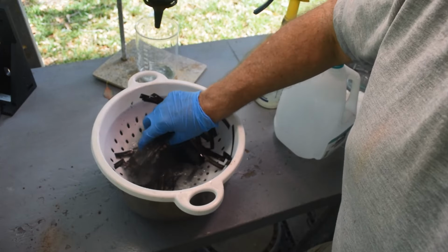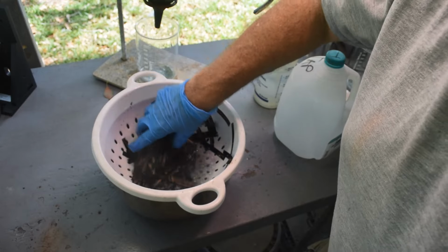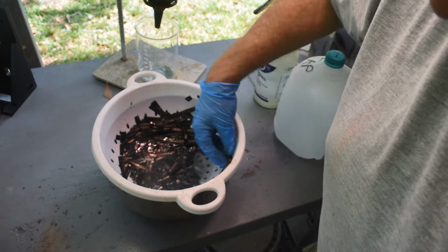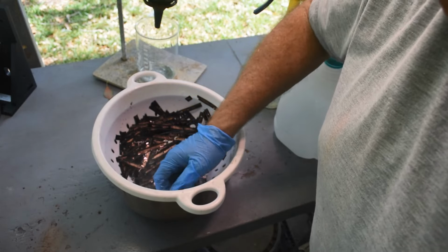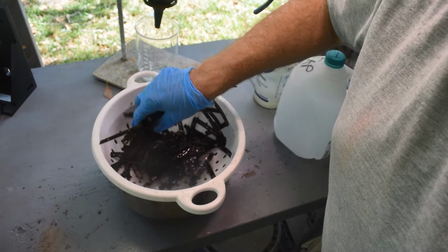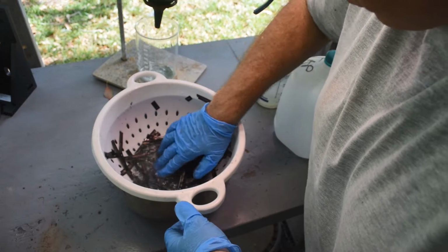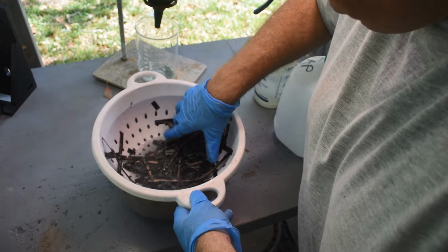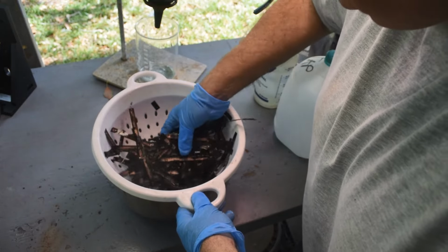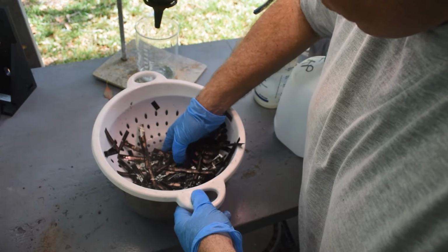And we can just wash these bits of circuit board material and make sure we get as much of the palladium out of it as we can. We may miss a little bit. That's kind of unavoidable, unfortunately. And I think the amount we miss is going to be pretty minimal compared to the amount we capture, because I'm not seeing, I see a little bit in places.